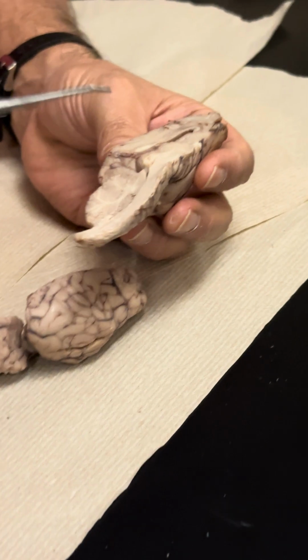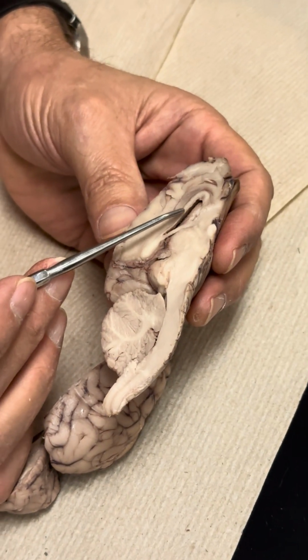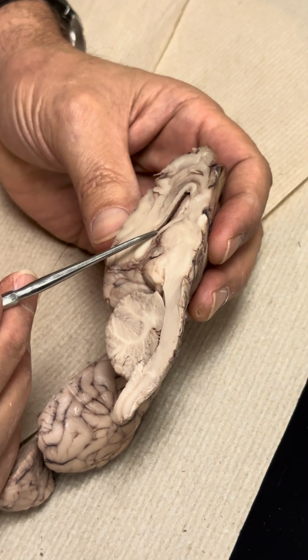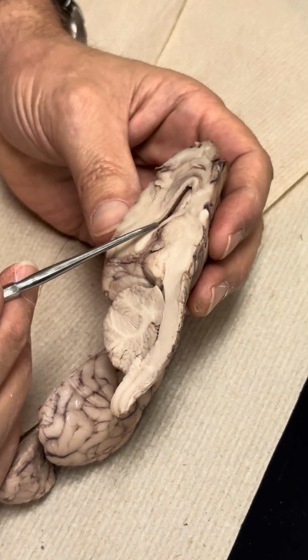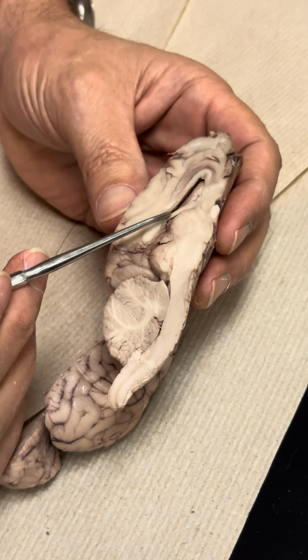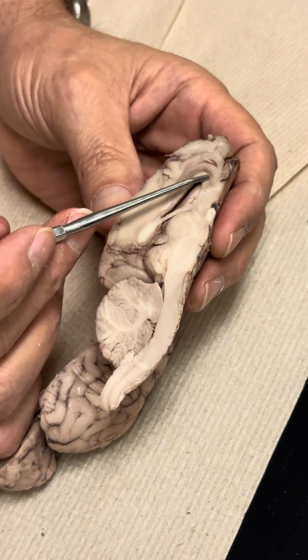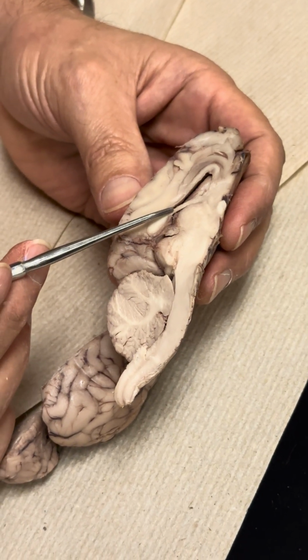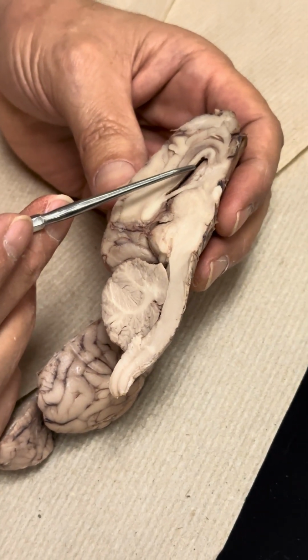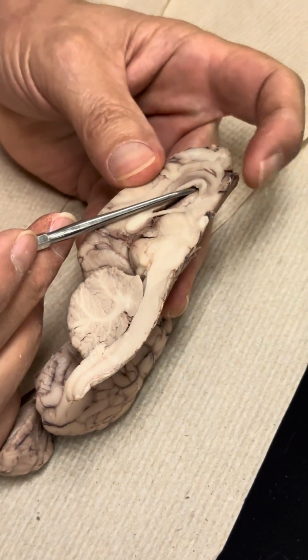Okay? So here's our corpus callosum. Got it? Yes, sir. The anterior aspect of the corpus callosum is called the genu. There's your bent knee up there. Then the posterior part starts with an S: splenium. Splenium. All right. The corpus callosum forms the roof of the lateral ventricle.